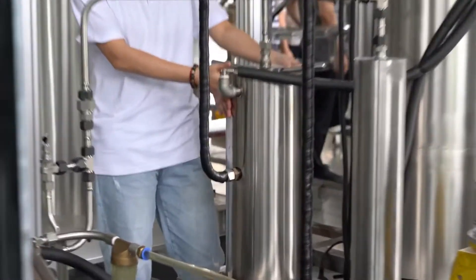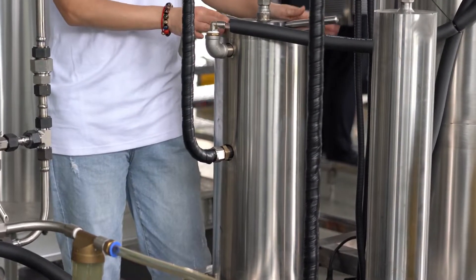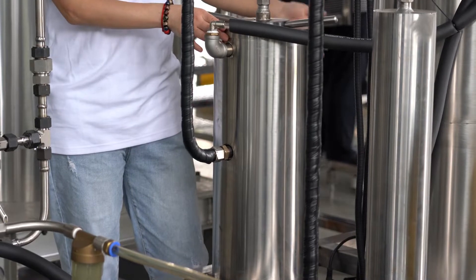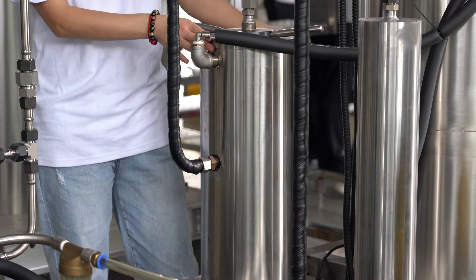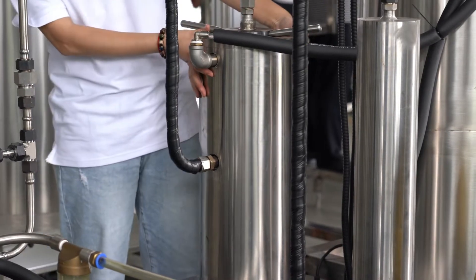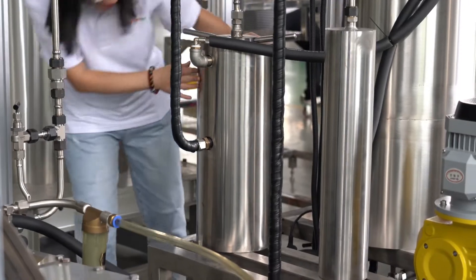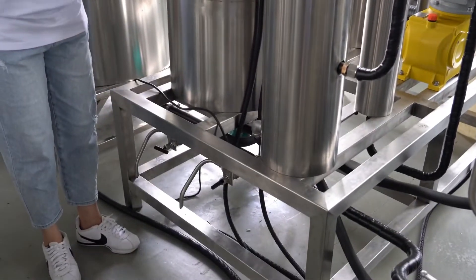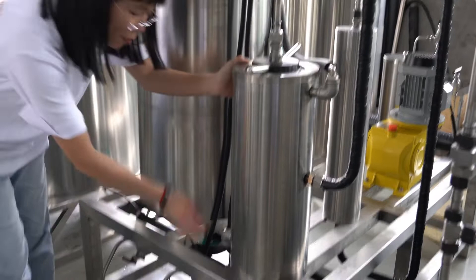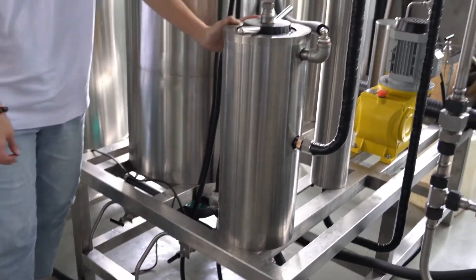This is another filter that purifies carbon dioxide. The vent valve of the filter should be opened frequently to vent water; otherwise, the filter will not work properly.